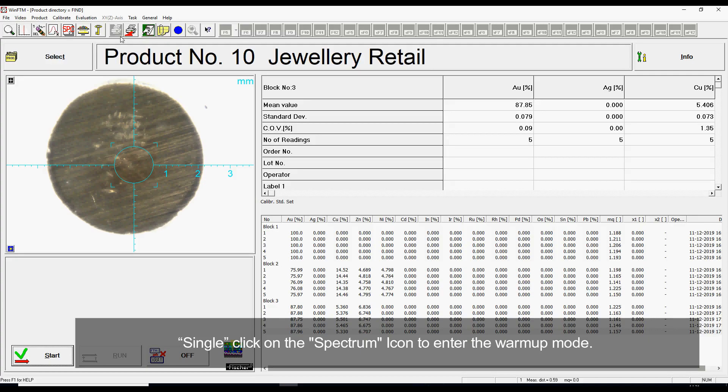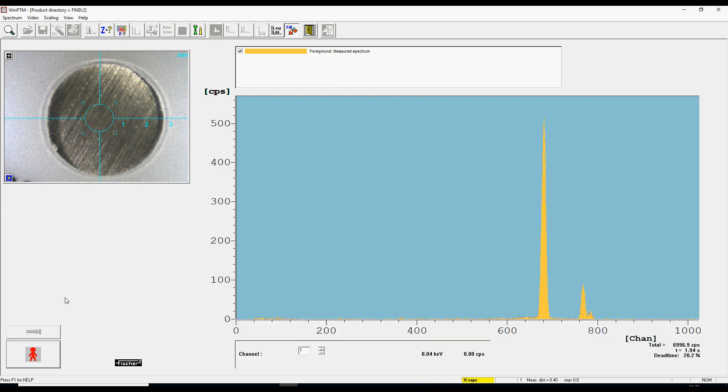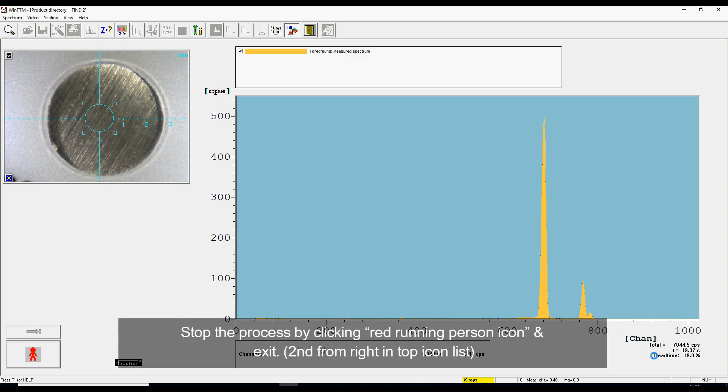Single-click on the spectrum icon to enter the warm-up mode. Click on the green running person icon at the left bottom of the machine and leave it for a minimum of 500 seconds. Stop the process by clicking the red running person icon and exit.